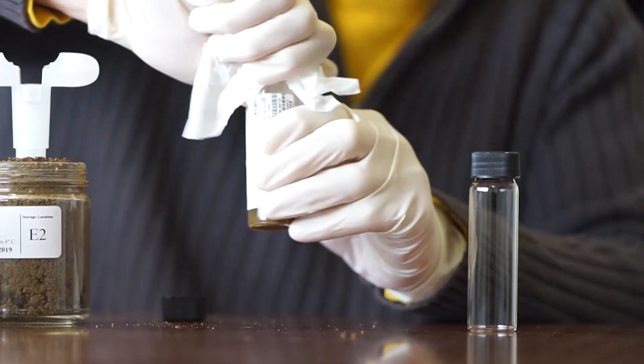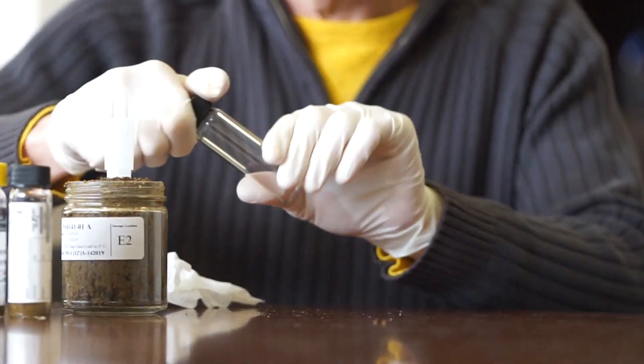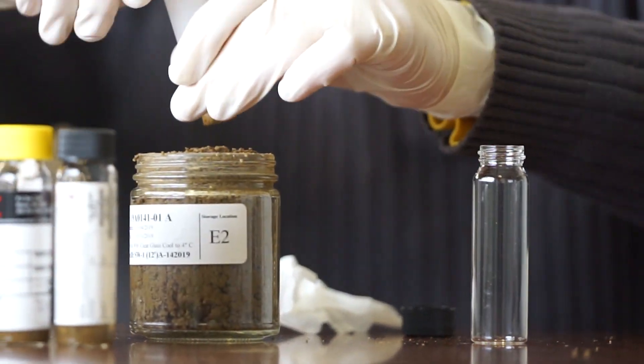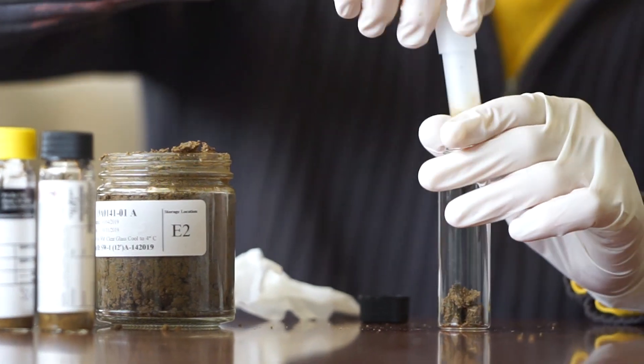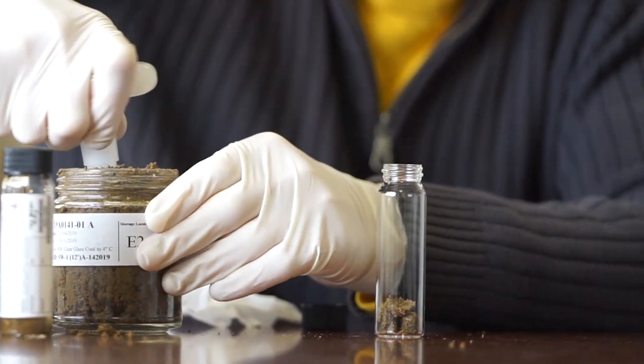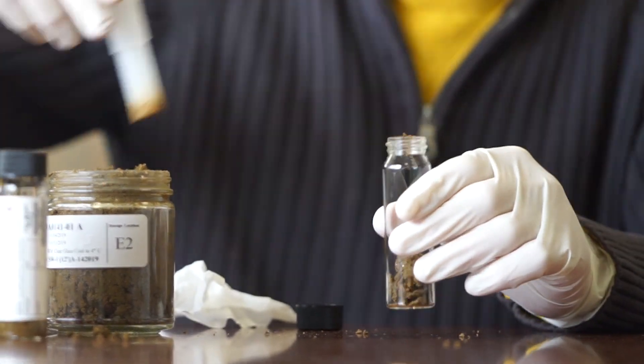The fourth vial does not have to be pre-measured, so you can either scoop it with a scoop, or you can go through the same exercise and put your 5 grams in there. You could actually put two aliquots in there.